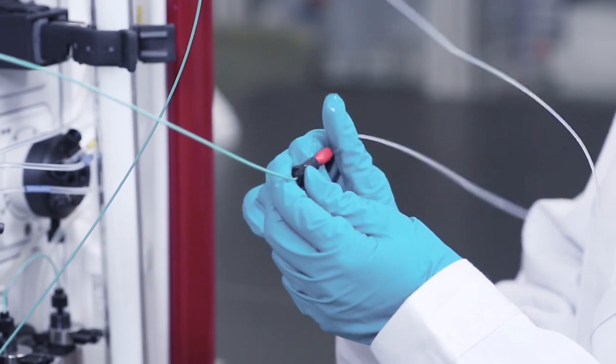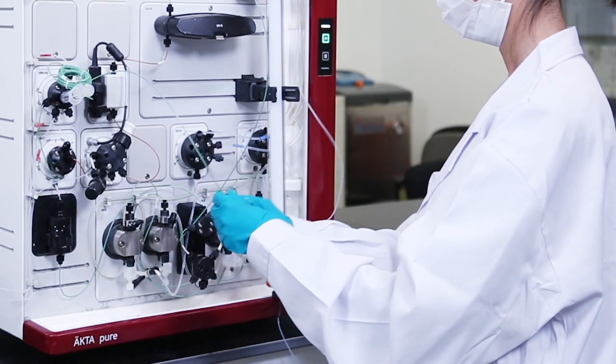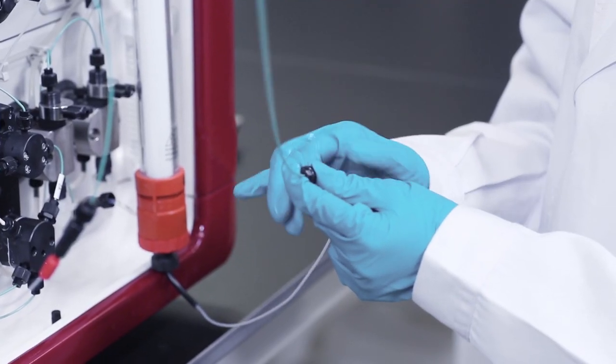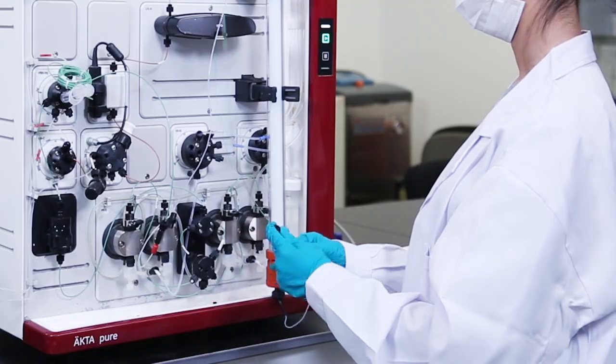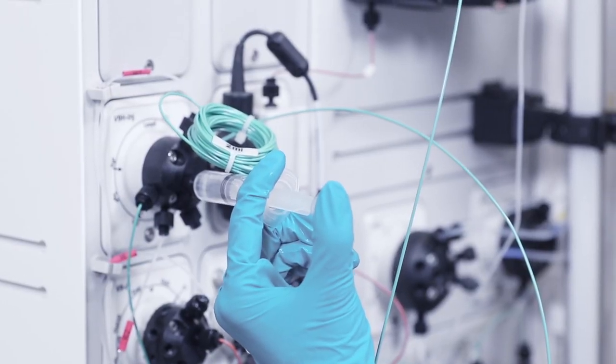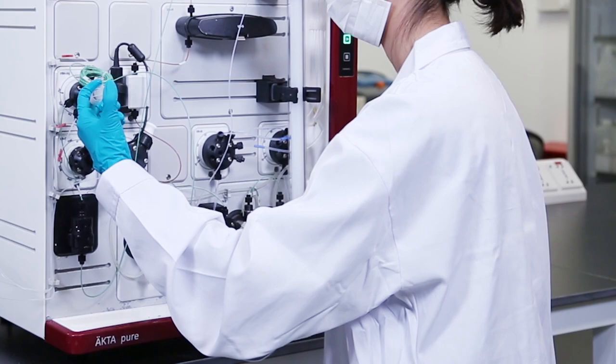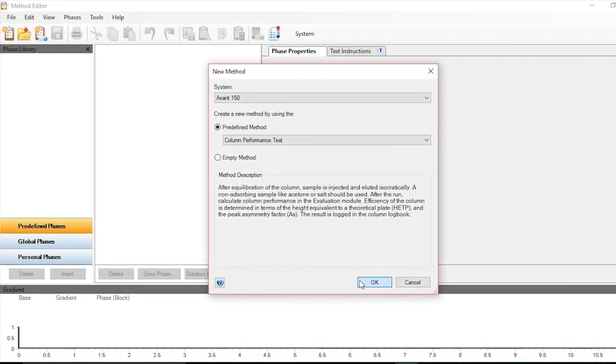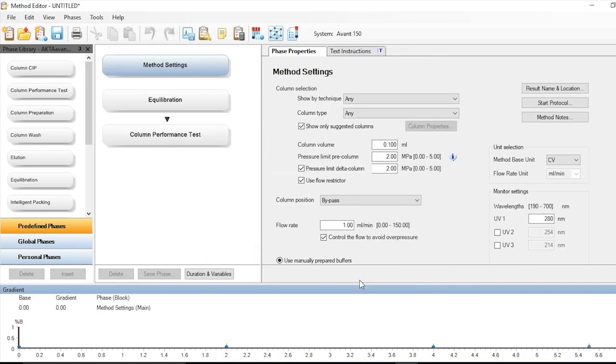Mount the column to the system and make a drop-to-drop connection. Use a syringe to inject the sample to the sample loop. In Method Editor, choose the column performance test template. Type in related parameters, such as pre-column and delta pressure limit according to relevant column and resin, inlet of buffer, flow rate, volume of equilibration, and volume of sample application.